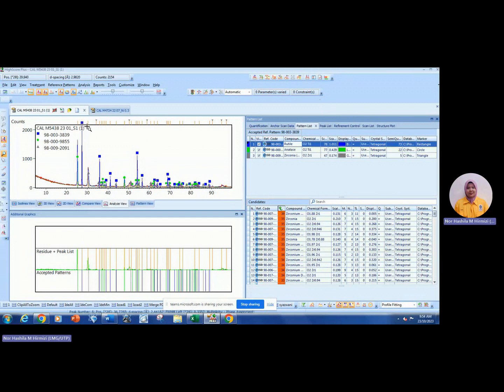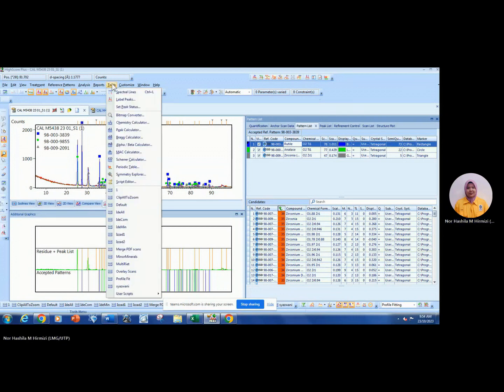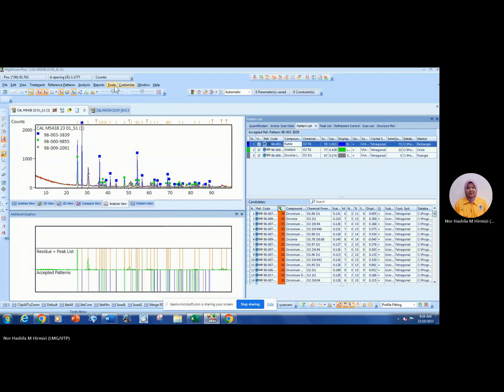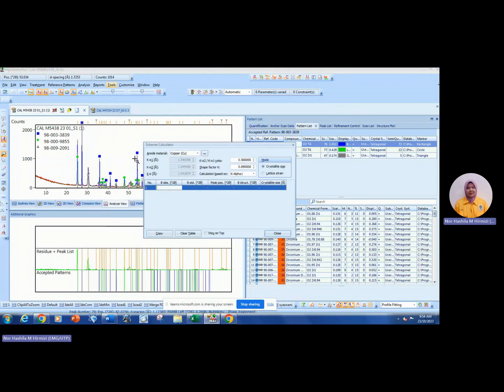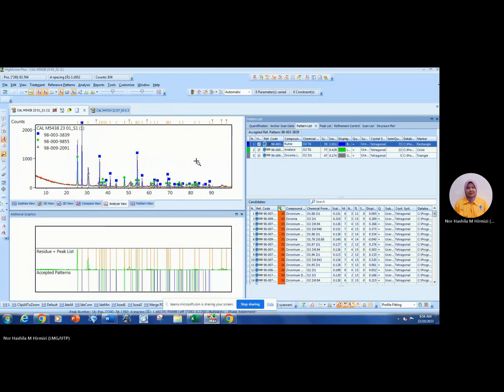That's all for search match and phase identification. If you want to calculate the crystallite size based on the Scherrer equation calculator, refer to the details. Good luck — if you have any questions, feel free to reach out. Thank you.